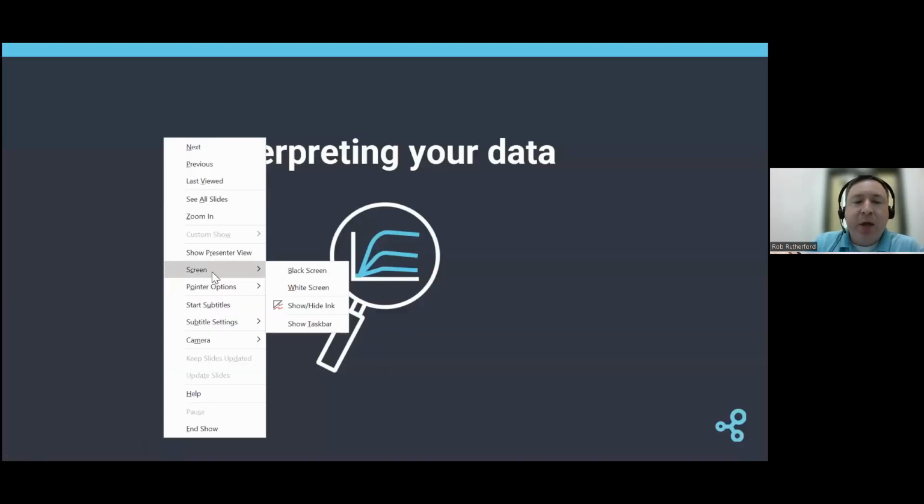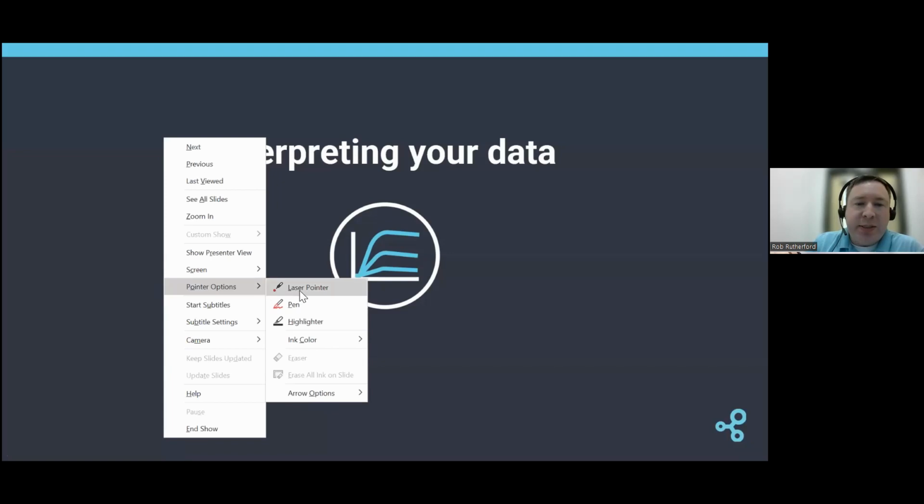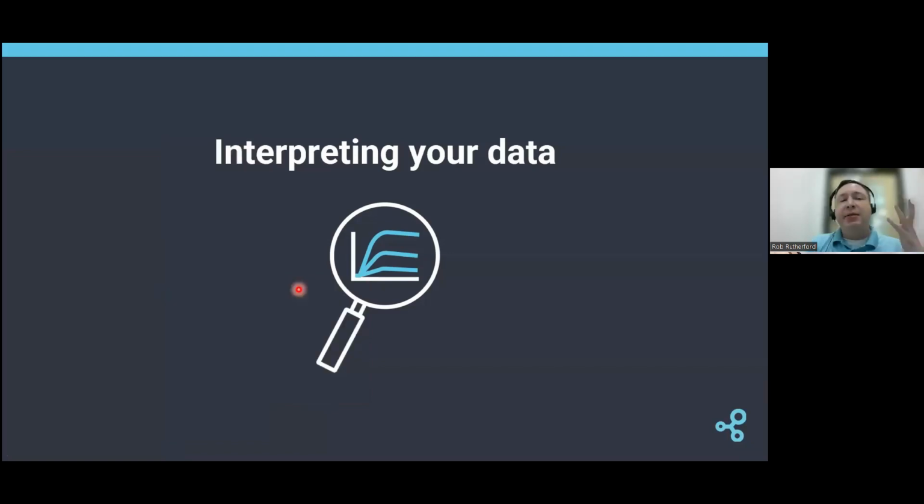All right. So now what we're going to discuss is, in our heads, we have run 5 different concentrations of analytes, similar to the video that we just saw. We end our test on the OpenSPR software, and you have the data file created once you've ended the test. If you try and do any analysis while the test is ongoing, you don't have any data to work with, don't panic. It's not generated until you actually end the test. When you do end the test, there's a couple of options.